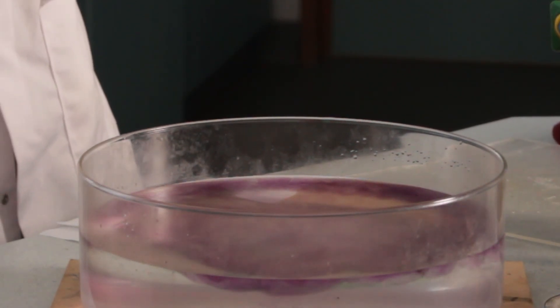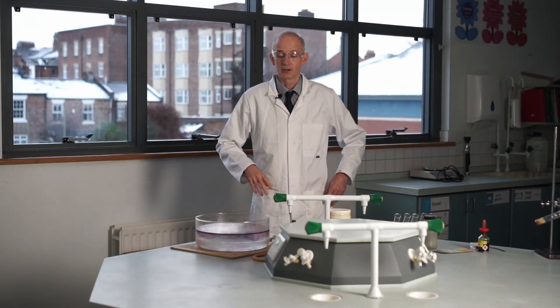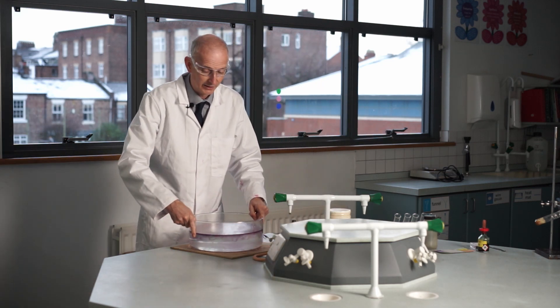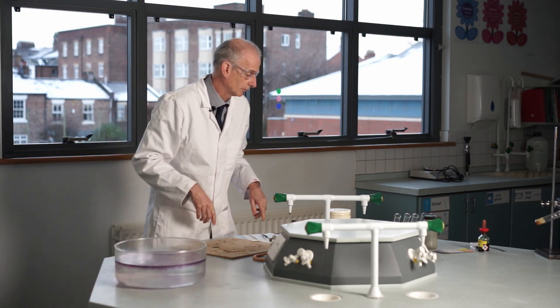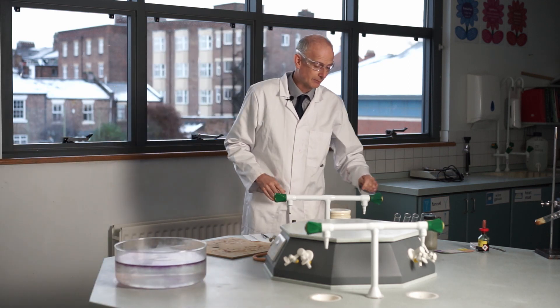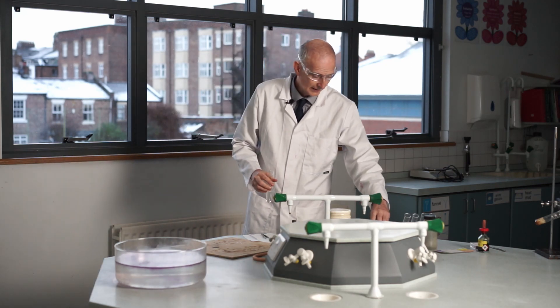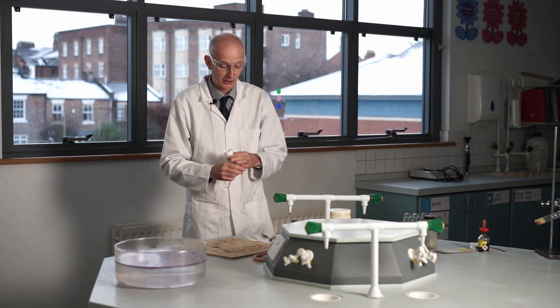So that was sodium with water. We're going to look at another metal now — calcium with water. I don't need the bowl for this; I'm just going to put some calcium in a boiling tube. Calcium comes as small chunks of metal.